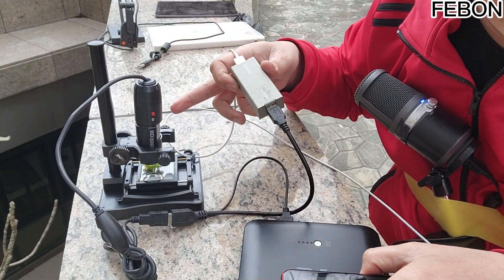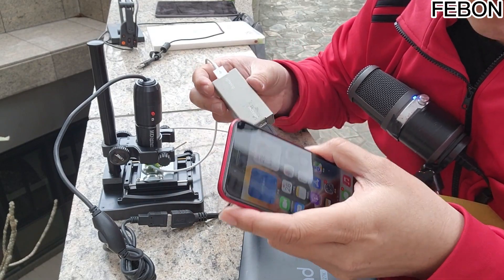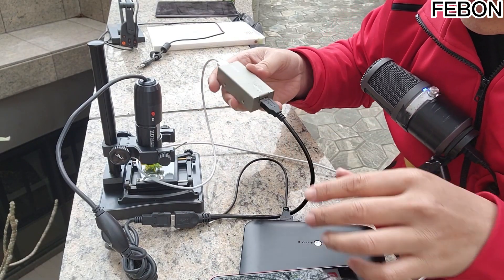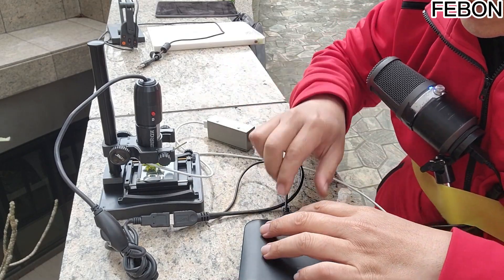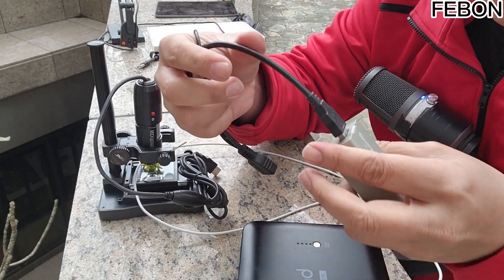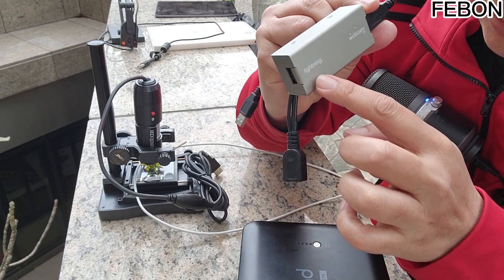How to achieve this — having the USB microscope picture thrown to this iPhone as shown? You should prepare this USB camera to Lightning converter. It is very simple. Like this — there are two connectors here. One is the webcam interface and the other is the Lightning interface.